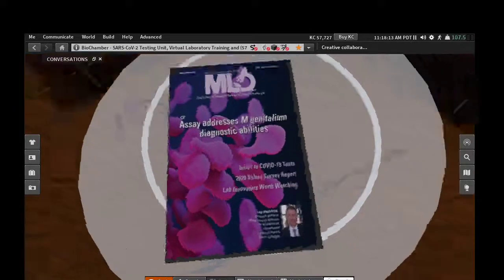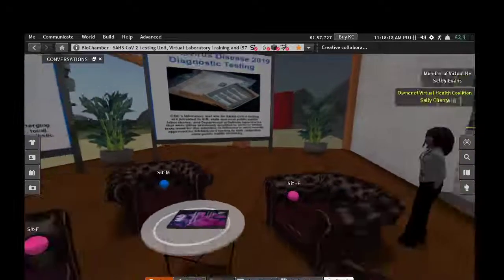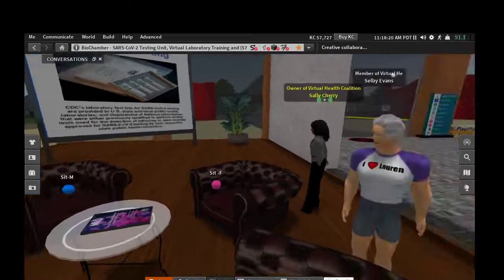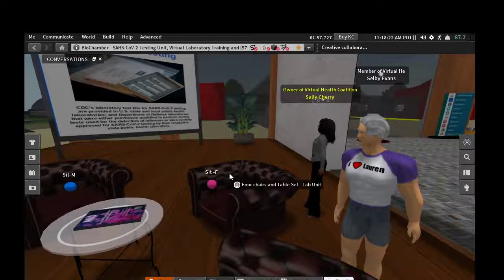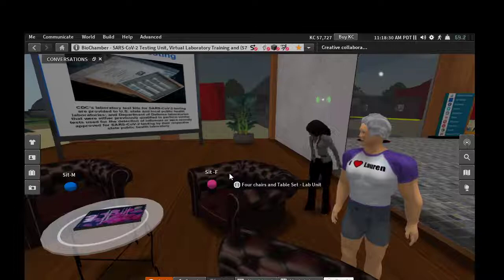Yes. And we even have a location if we want to do some training, and some of the training I'll be doing about the microscope, I can even test them here. I can do proficiency testing here. And I have my microscopes where they can click on the microscope and see different images. Like I said, we can visit that particular location at a different time.